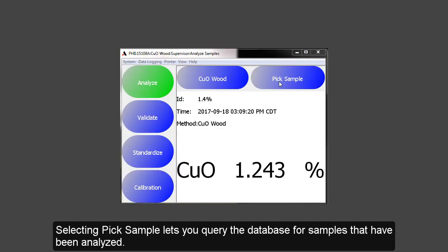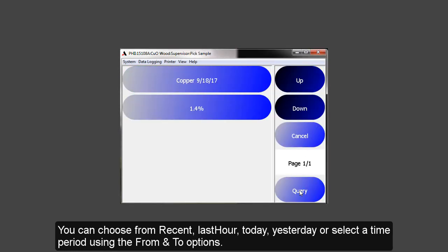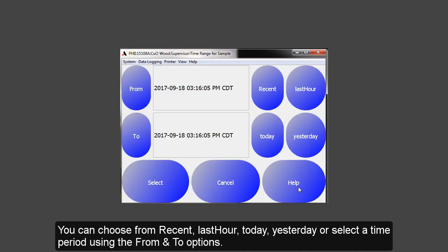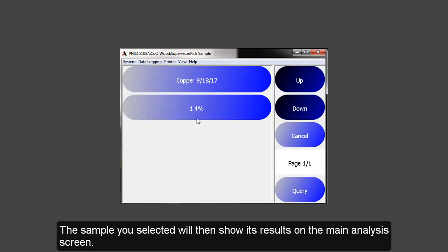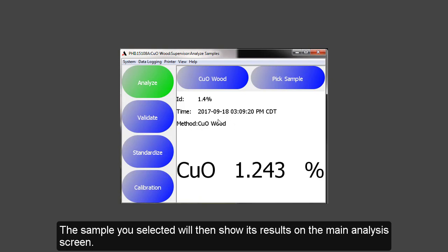Selecting Pick Sample lets you query the database for samples that have been analyzed. You can choose from recent, to last hour, to today, yesterday, and using the from and to, you can select specific time periods. When you select the sample, that information will show up on the main analysis screen.